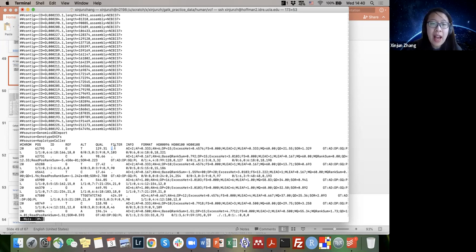So we want to add information to the filters to look through the VCF files and use different ways to filter things and to figure out whether or not we want to keep a specific variant. So say if we create different ways to filter things, and if it's still a pass, then we're happy with that, we keep it. But if not, then most likely at least we want to flag it so that we know that in our downstream analysis, this is something to look out for.